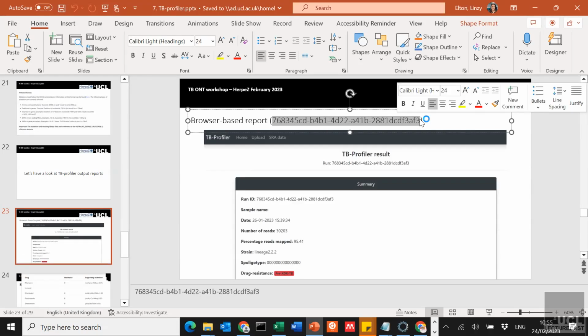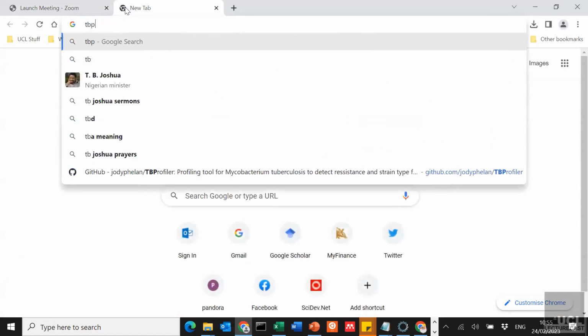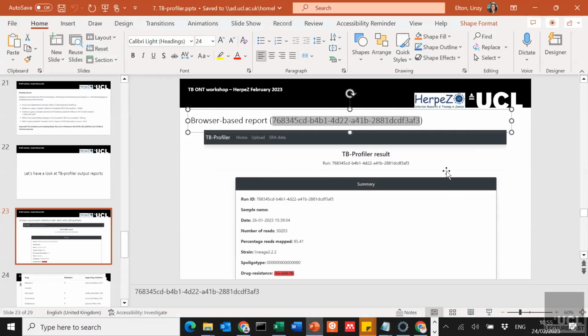Yeah. So we did that, we can put in FASTQ and FAST5 files. So I've very much got a "here's one I made earlier" in case we couldn't upload it in a sensible time. So I've already uploaded a file. Did you upload the FASTQ or the FAST5? FASTQ, you can't upload FAST5s. Okay. It won't work on FAST5s.